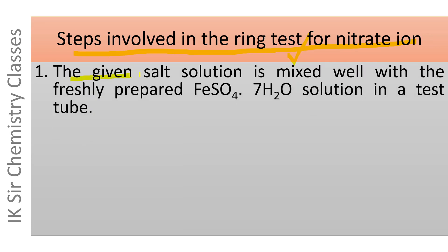The given salt solution is mixed with freshly prepared FeSO4·7H2O solution in a test tube. The salt solution in which the presence of nitrate ion is to be detected is taken in a test tube, and freshly prepared FeSO4·7H2O solution is added to it and the two solutions are mixed well.